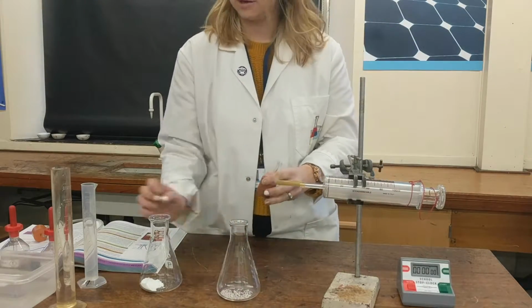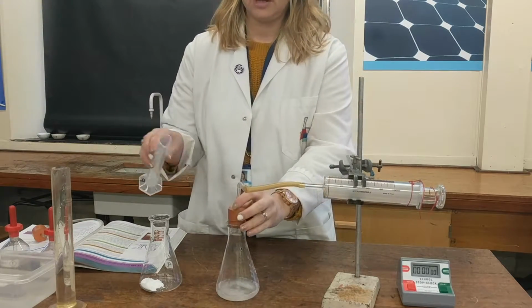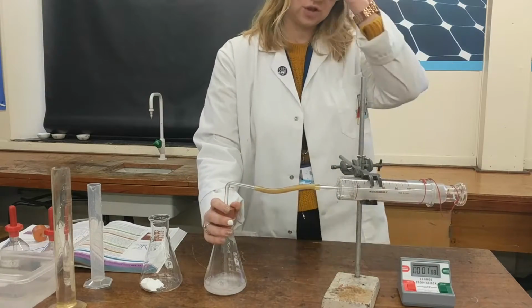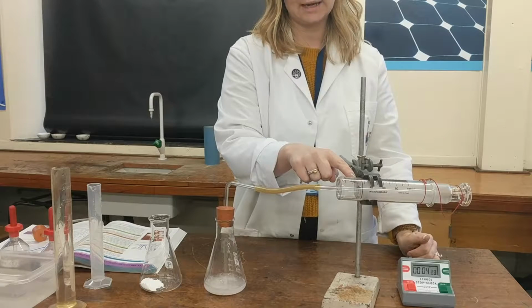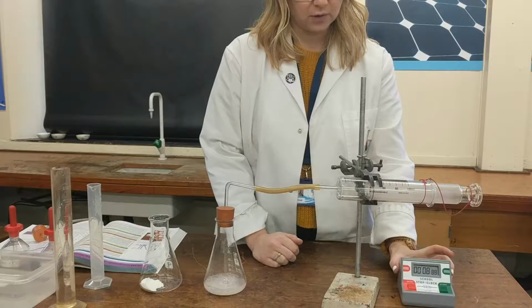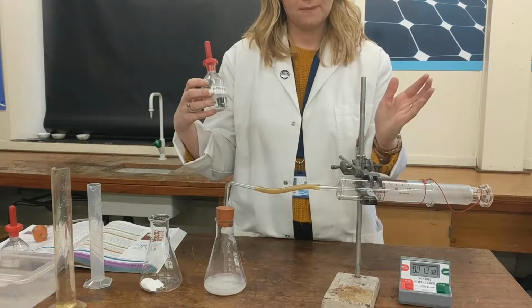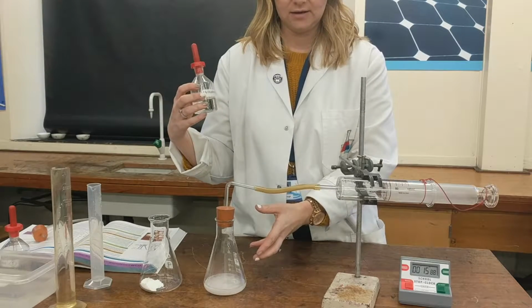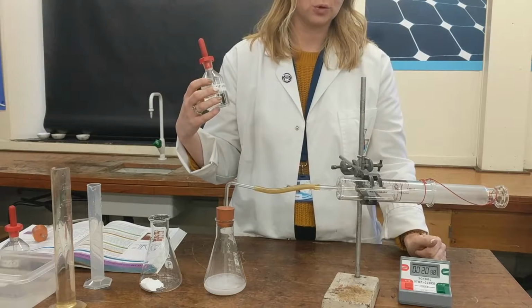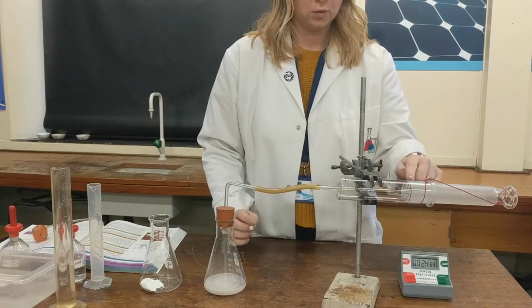So I just want to show you how this one works. You would put your acid in, and as soon as you've put it in, you must put the stopper on and start the stop clock. So as you can see, it's moving quite quickly, and the gas is being produced very quickly. If you've used a higher concentration, there's more collisions happening in there, and so the reaction will be faster, and so the gas will be produced much more quickly. Now we haven't even had a chance to get to 30 seconds on that one before we've reached 100.